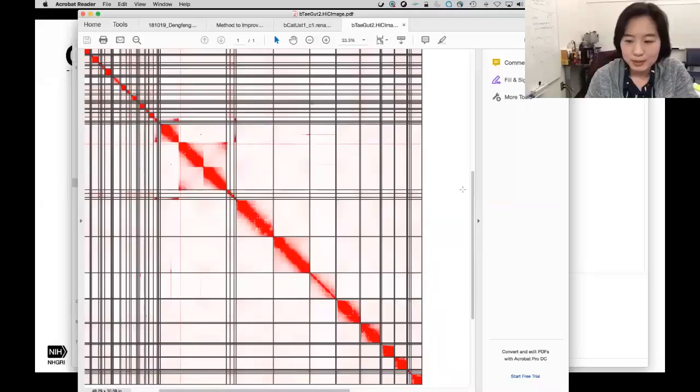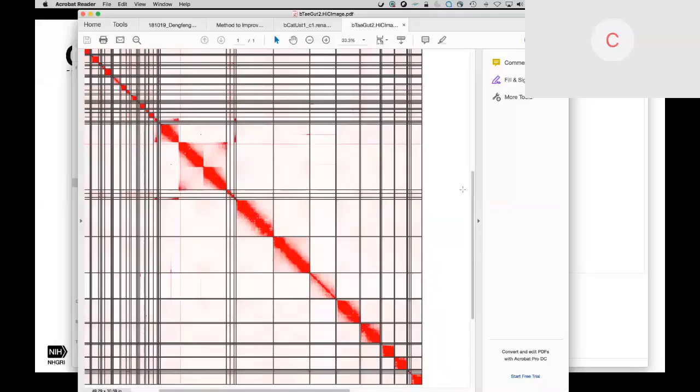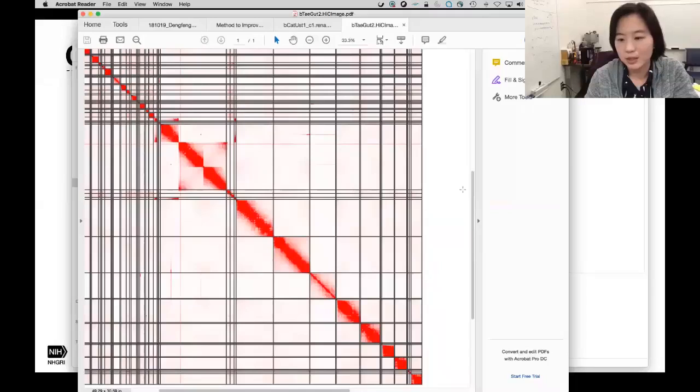So what we discovered from the first data release genomes was there weren't actually that many problematic regions left. I see. Do you think it was because they got scaffolded by BioNano first and then Hi-C, in that order, that made it good, or in general the data is good? I'm not sure. Yeah, in general, if you get bigger contigs or scaffolds to feed into the next step, you get better scaffolding results, was what we observed. I see.